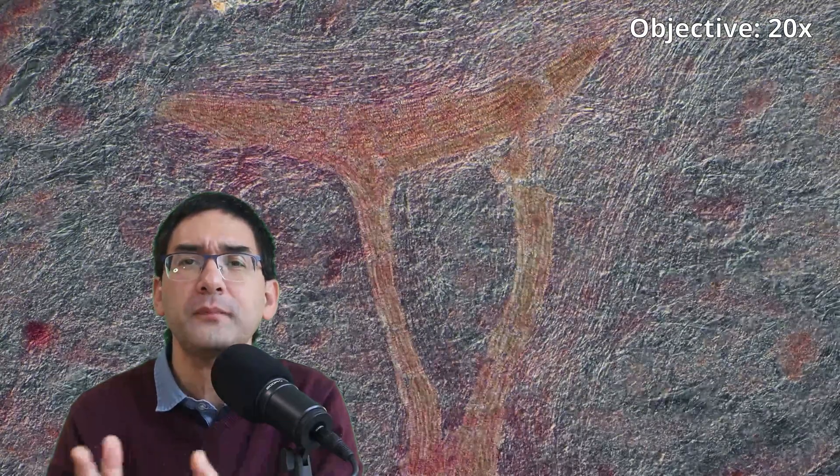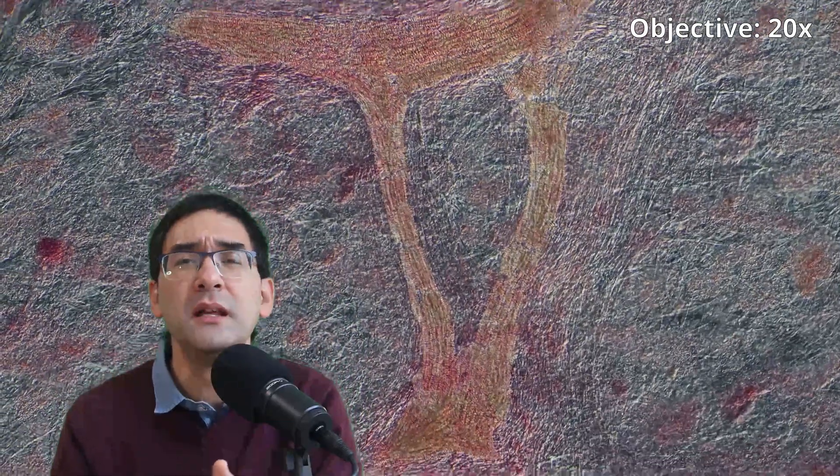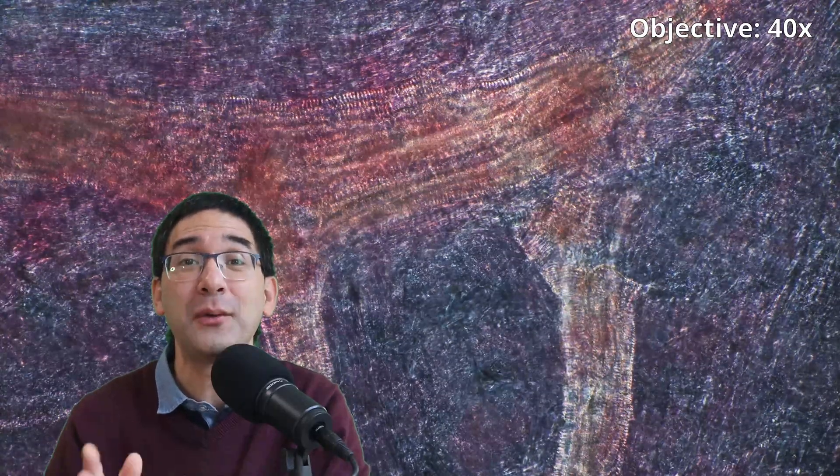This was a strange thing of a different color and I wondered what could this be. And I zoomed in and then actually I realized, and maybe some of you also realize what this is, and this is a dead giveaway as we say. And from this point onward I was certain that this is now an authentic real cherry.